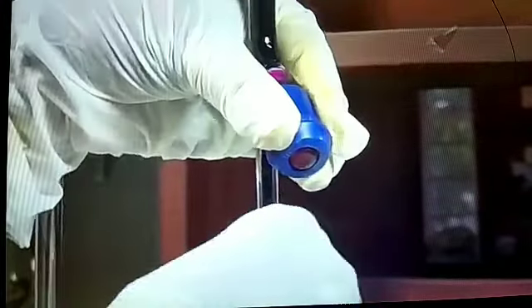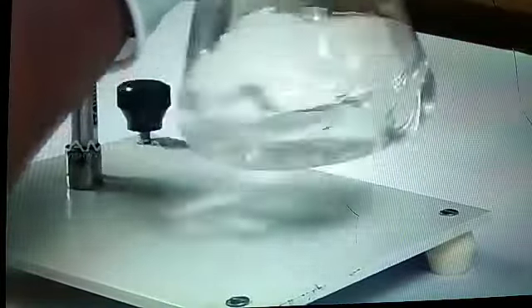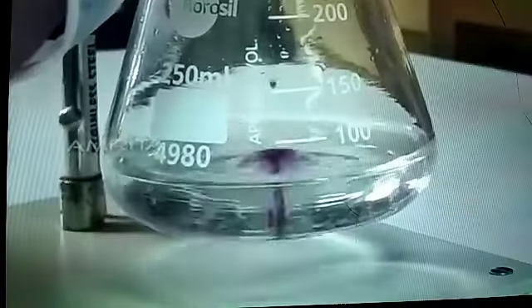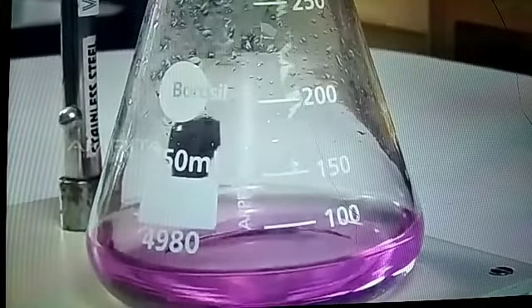Run potassium permanganate solution dropwise from the burette into the conical flask with constant shaking of the solution in the conical flask. Continue till the color of the solution changes from colorless to light pink on addition of the last single drop of potassium permanganate. This is called the end point.